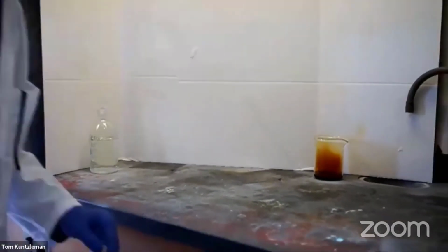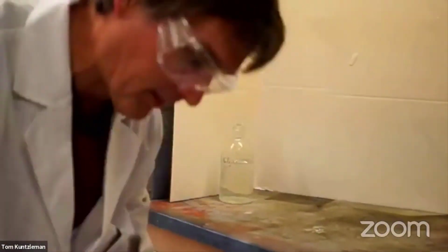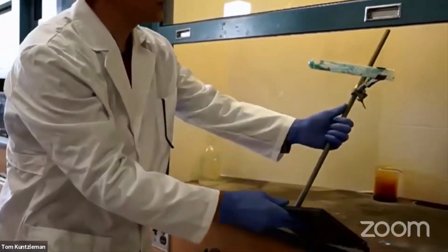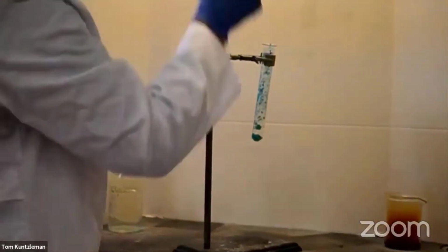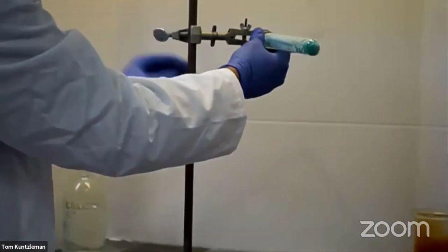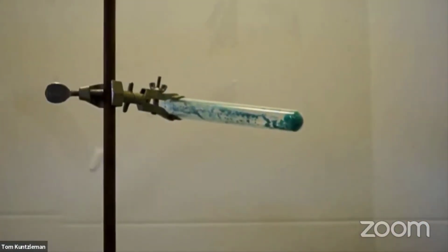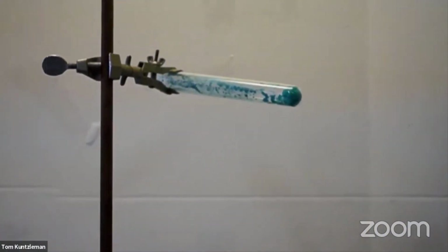Here it is. Excuse me. And we can take some questions. What in the world is this? Oh, I got my test tube here. I can put this up for this one. All right. Get this out of here as well. The next reaction. Okay.